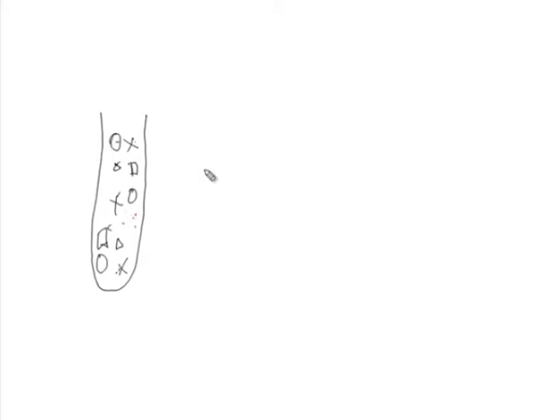Now, when you apply a particular centrifugal field, for example 1000 G, then the larger components will settle, like we said, cell debris and other very heavy nuclei.